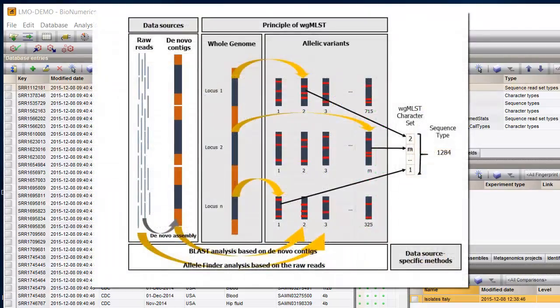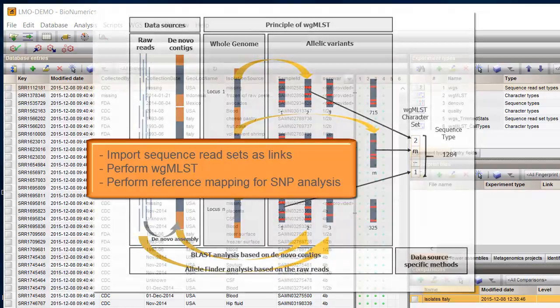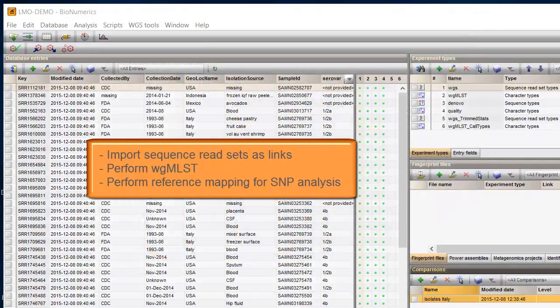For example, the locus presence and the corresponding allele variant is determined. And you can perform reference mapping for whole genome SNP analysis.